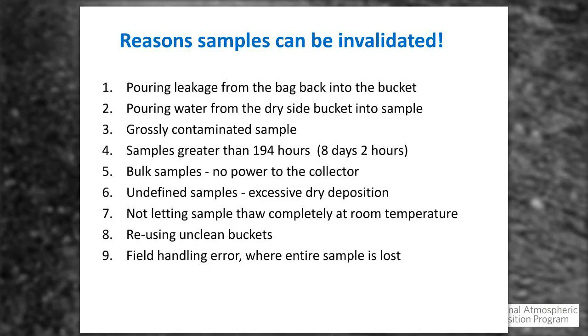Not letting the sample thaw completely at room temperature, I addressed that. Don't put it next to a heater. We've actually had operators that put it next to a heater and melted the bucket. Reusing unclean buckets: once you use your bucket, put it in your used material box and get it ready to ship back to Cal to get it replenished. If you have a bad dry side bucket that you want to replace, and you want to take a bucket out of your used supplies and make it your new dry side bucket, you'll be shipping back 5 instead of 6. Please make a note when you ship in your big box that you've used one for your dry side.